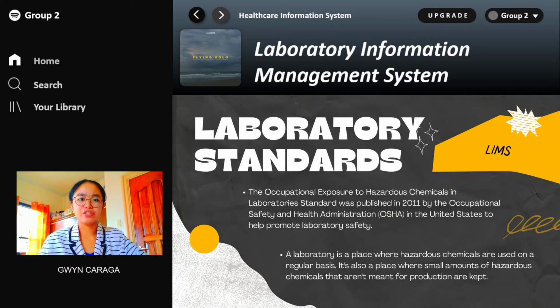Laboratory standards. As we all know, inside the laboratory, there must be standards or safety procedures that we must meet in order for us to enter or use the lab. So what are those laboratory standards that they set for us to meet before we can use the lab?